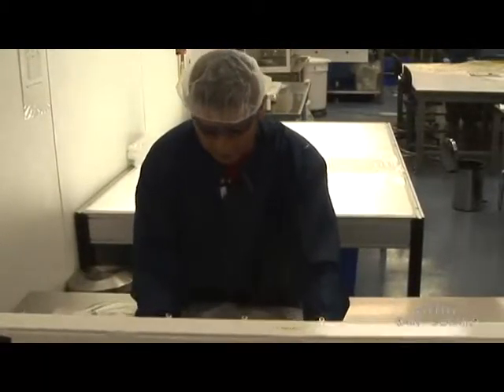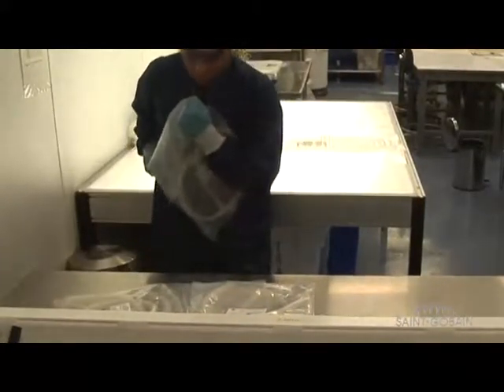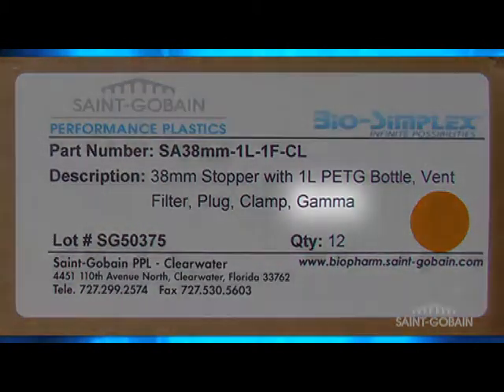Once your assemblies and components are manufactured by Saint-Gobain, we further reduce your validation costs and contamination risks by packaging in an ISO class 7 certified clean room. Further, all assemblies that can withstand gamma radiation can be ordered sterilized with a sterility assurance level of 10 to the minus 6 to save valuable time.